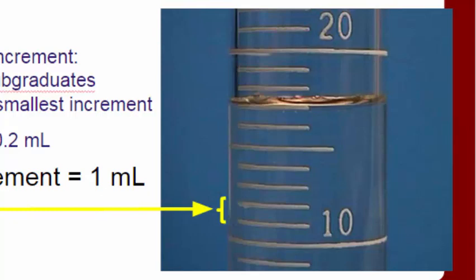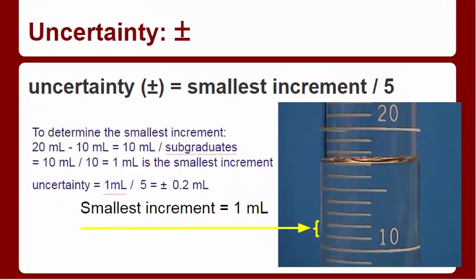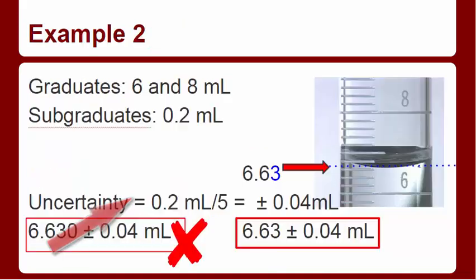So we're kind of taking the in-between route. Instead of dividing by 10, I don't think you can be that good. No, I don't think so. And instead of dividing by 2, I think you can be better than that. Yes. So 5 is a good number. But if you take further chemistry classes in college, you might want to check what they use as their division, because there's debates about what number to use. Okay. So for this class, we're using number 5. Okay, here's a final example.